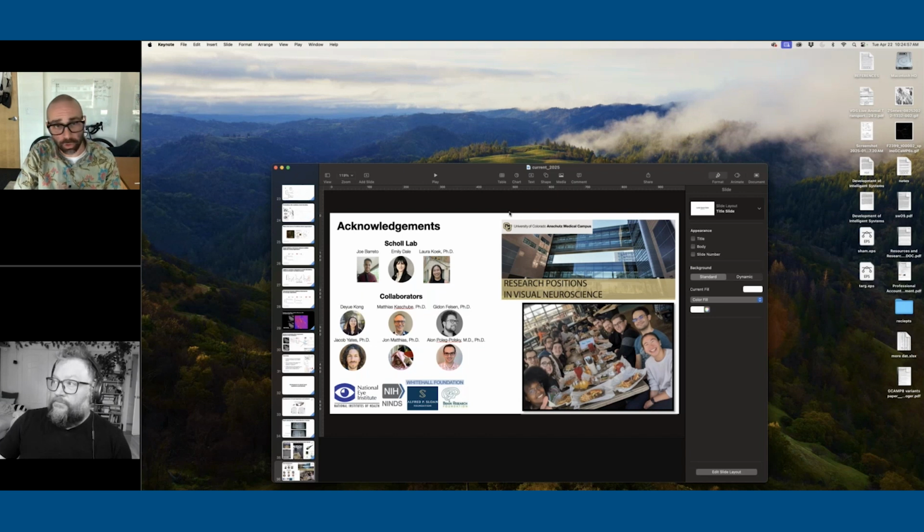But that has two caveats. First of all, the two-photon absorption of these tools is very wide, right? And so most people actually try to do their imaging and stimulation around 900, 920 nanometers to avoid activating those sensors. So if your prep has very low expression of GCaMP and you have to use more power, you actually start introducing excitatory activity throughout the whole thing, and you'll see epileptic events and things bumping around. So you don't want that.